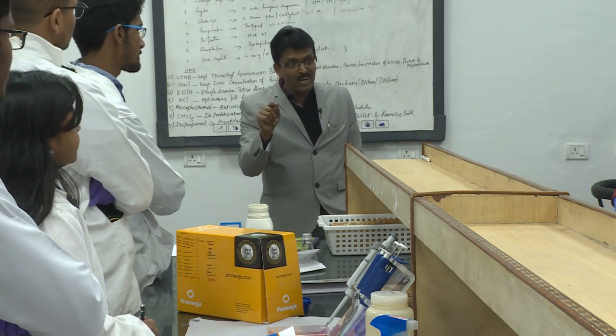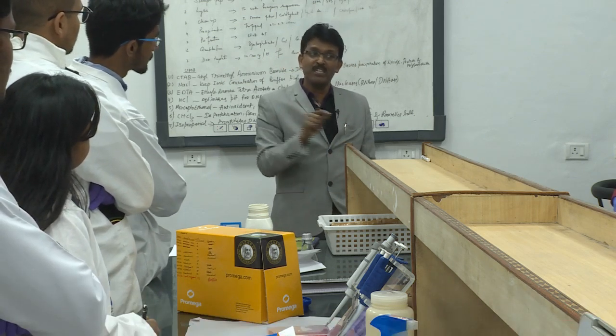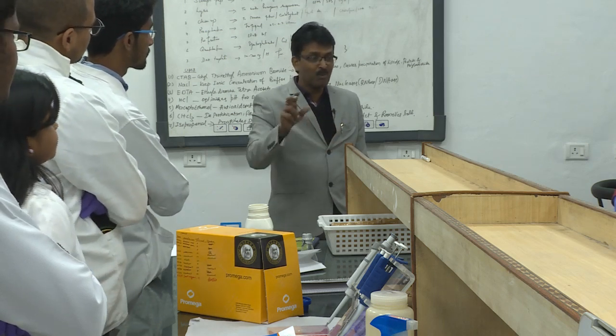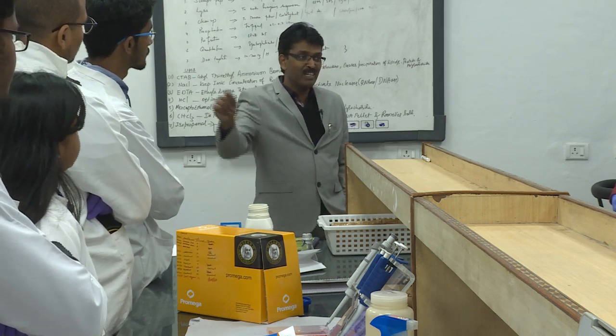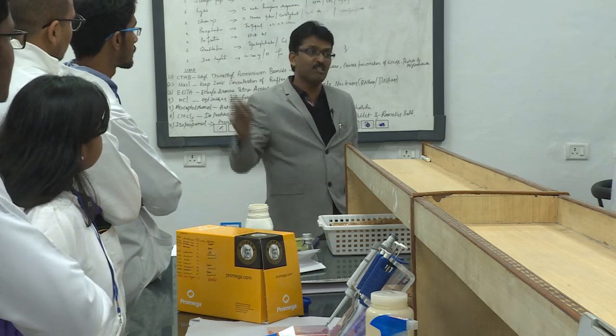If you take another colony from the same plate, you think okay, I am taking from the same plate, both the colonies are looking alike, no problem, I will take one colony for preservation and another colony for identification, or sometimes you have the tendency of making multiple preservations.